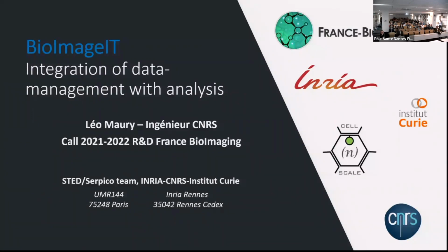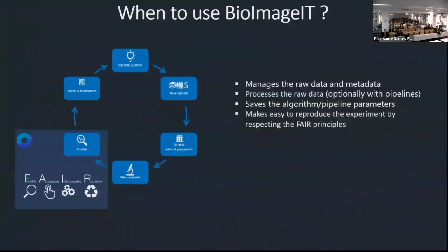So to talk about BioimageIT, I will answer a few questions. The first one is when to use BioimageIT. To have some context, you have here a very schematic view of a scientific study. I will not describe all the steps because I don't have the time, but I will focus on the part after the measurements and the acquisition of the raw data.